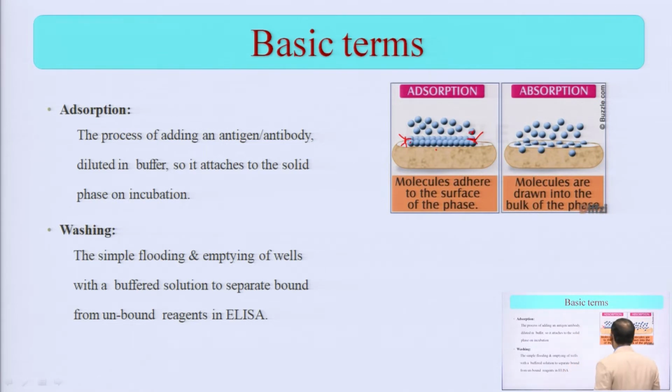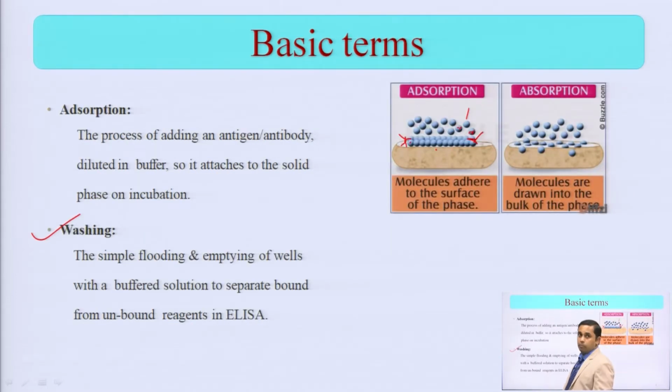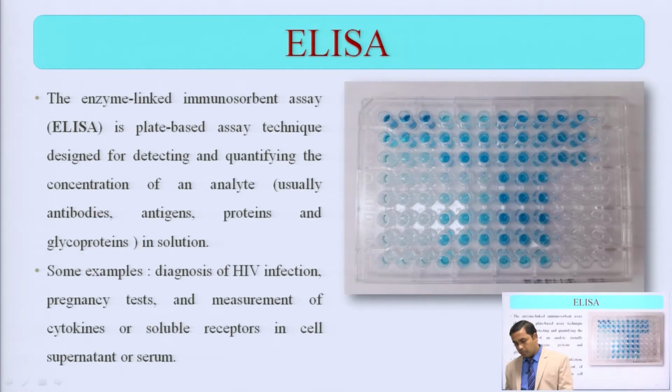So, after that we have to do some washing, because if any other extra chemical comes here, it will create a problem in our reaction. So, we are doing washing. Okay. I hope it is very clear to all of you about the basic terms I have told you in these 2 slides. Now, let me take you to the main part.